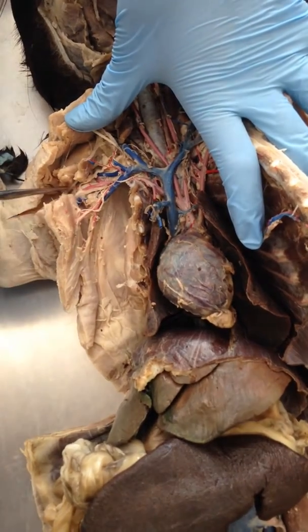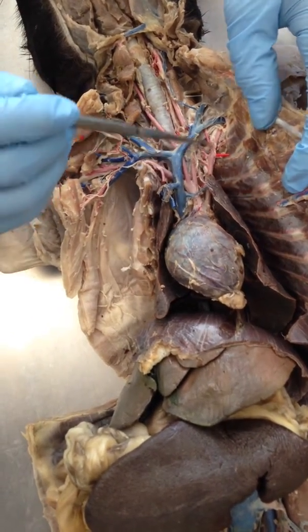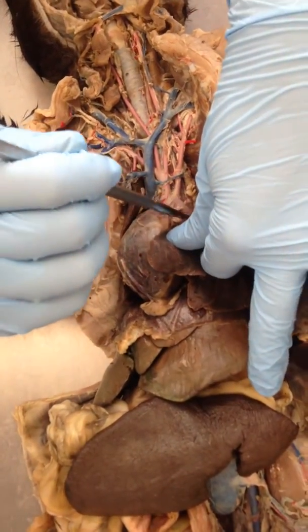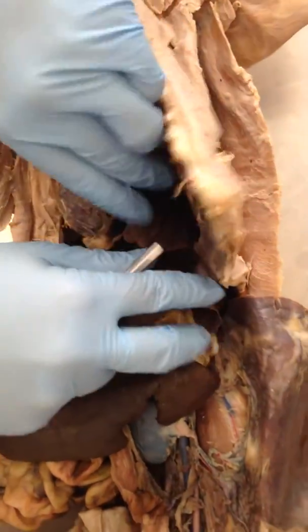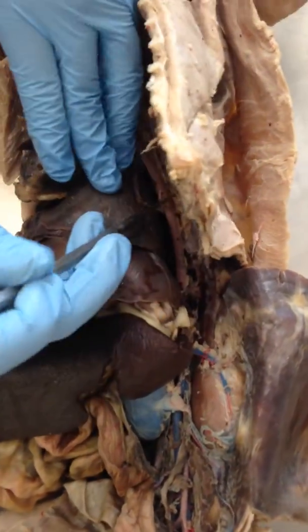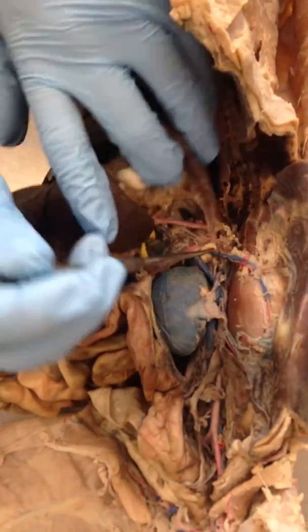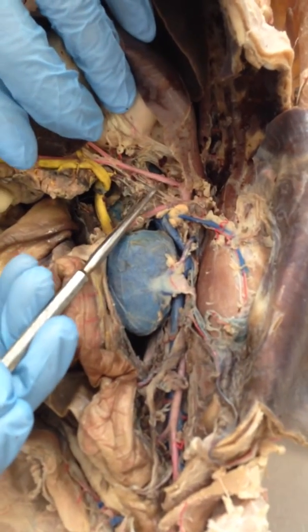Do we need to know these at all? And this is also a subclavian over here. Correct. The aorta comes down into the brachial, which is down on the side. It's just the descending aorta all the way down.